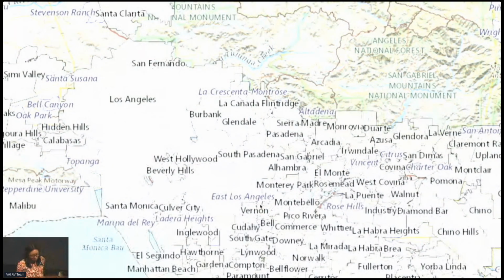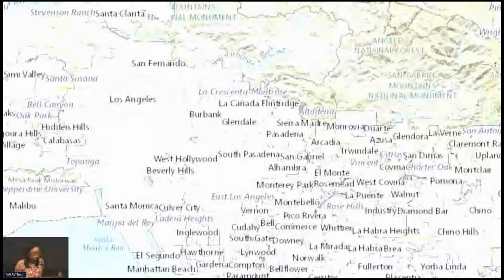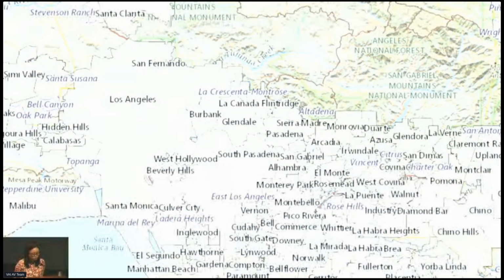You can basically think of a SpatialFeatureExperiment object like a layered map. Here I will introduce the major types of spatial data in geography, whose infrastructure I have borrowed for spatial omics in SpatialFeatureExperiment.